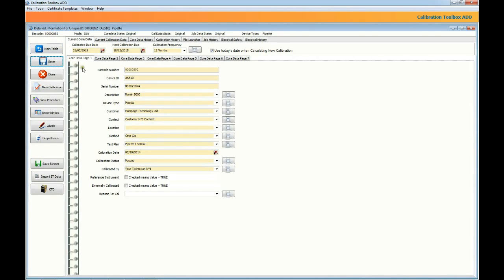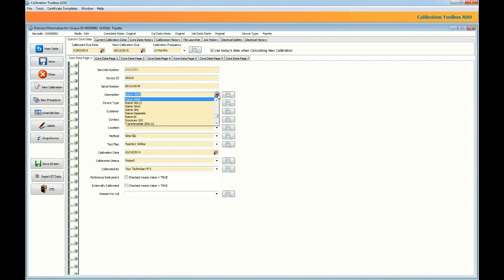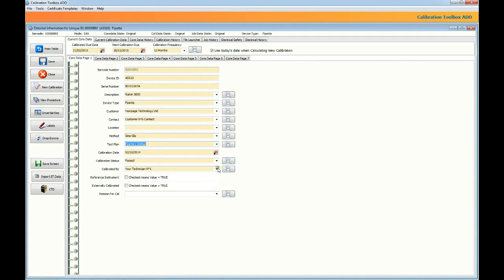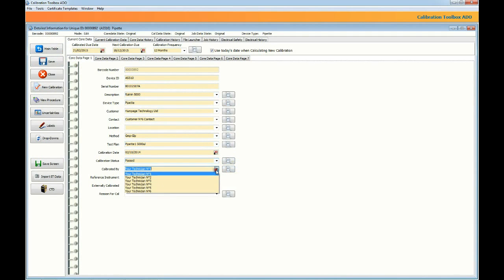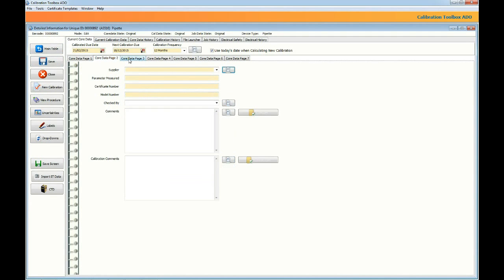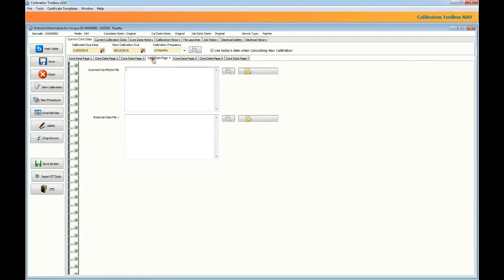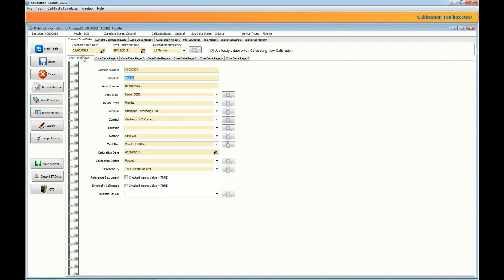So the first thing we're going to see is the core data. Core data is information about the particular device more to do with asset management. What it is, where you got it from, who's got it now, when it wants calibrating, how often it wants calibrating. But do bear in mind that all of this is totally configurable in calibration toolbox. You can see pretty much exactly what you want to see. The various pages appear on different tabs. You can hide or show whatever you need.